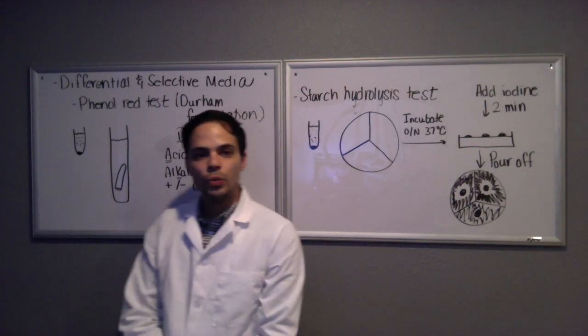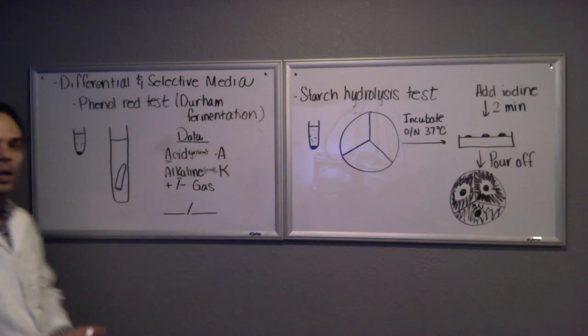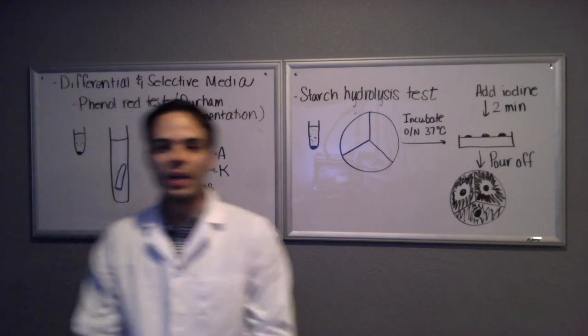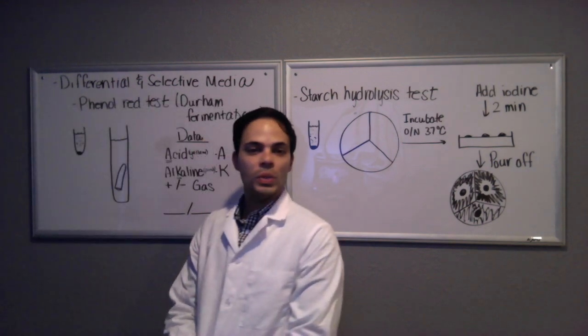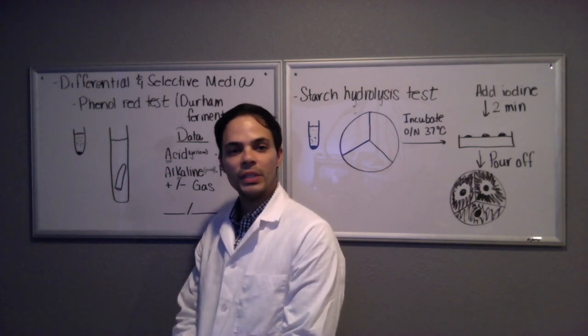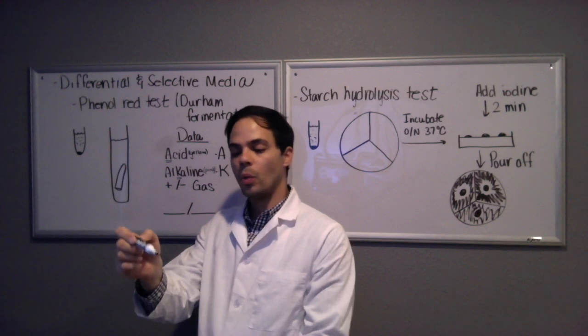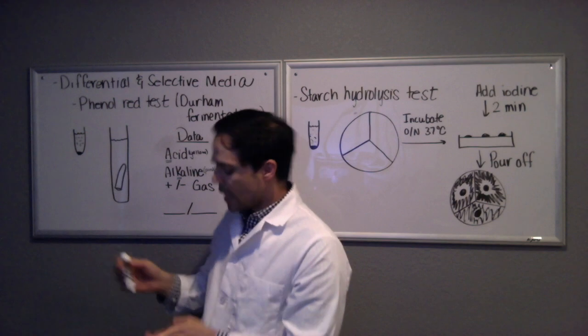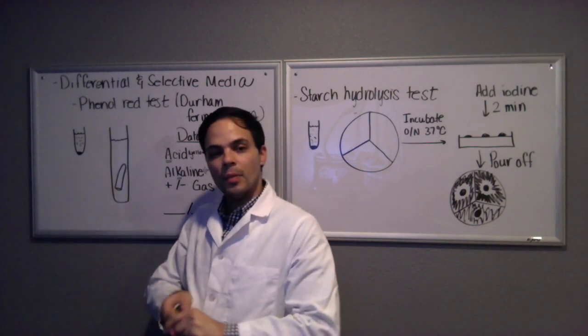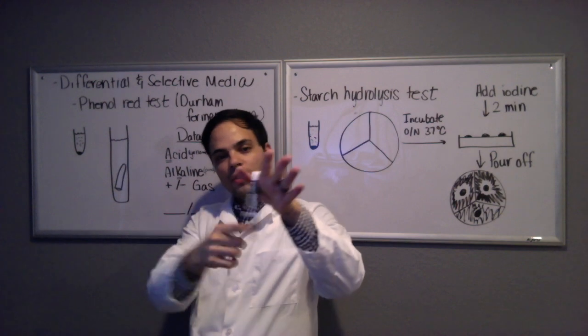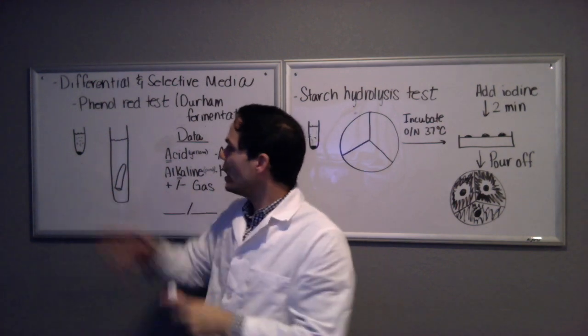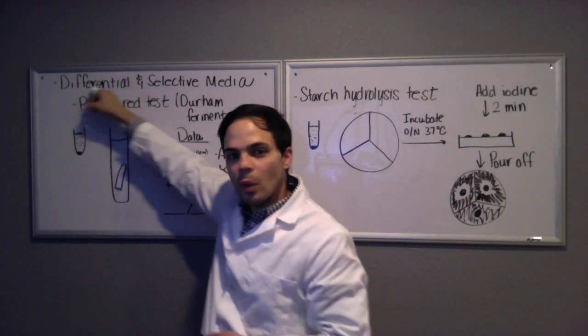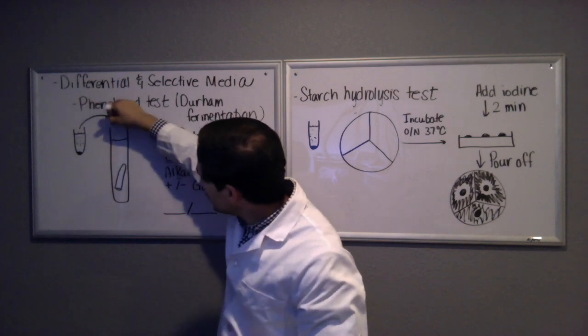So how then do we inoculate this medium? The way that we're going to inoculate this medium is from a pure culture that was grown overnight in nutrient broth. Using your aseptic technique as we discussed in the previous video, you want to get your loop and flame it in order to incinerate any microbes on your inoculation loop. Once you have resuspended this by holding it between your thumb and forefinger and spinning the tube like this, you'll resuspend the pellet.